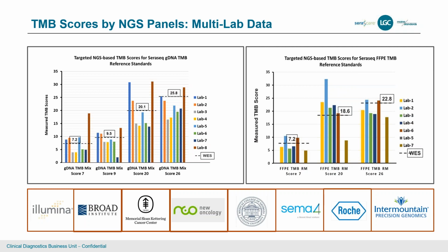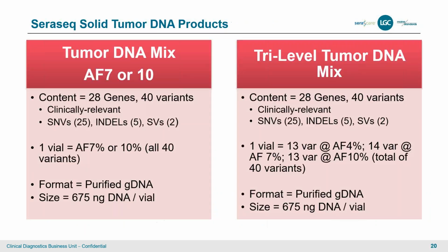So this theme really emanates through all our products, right? You can only assess your workflow and your assay with a common standardized material. And then you can change whatever variable, operator, lab, methodology, instrumentation, and you can clearly see what the impact is. Okay? So keep this in mind as you think about the power of these reference materials.